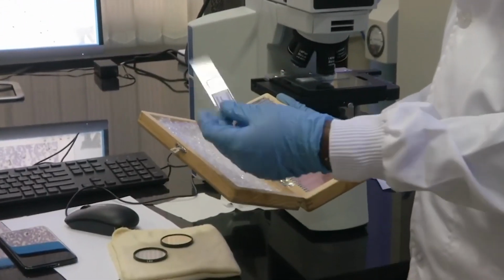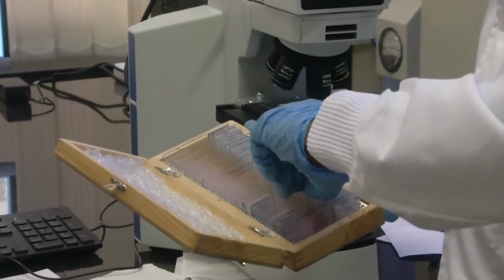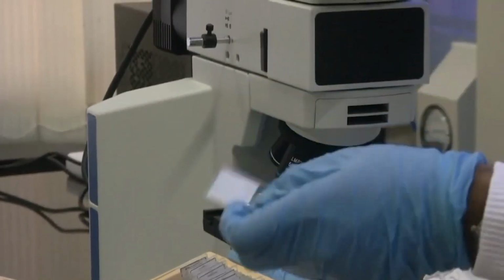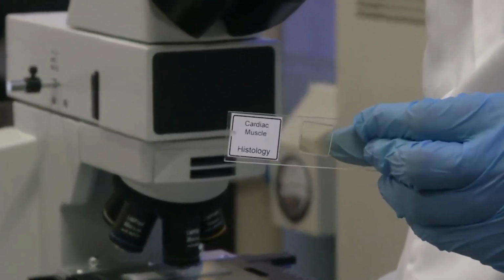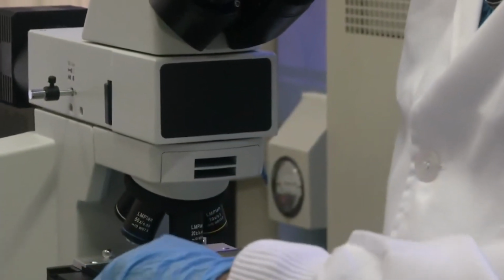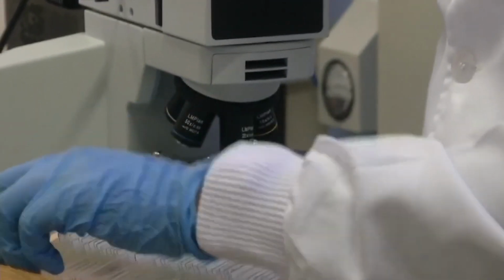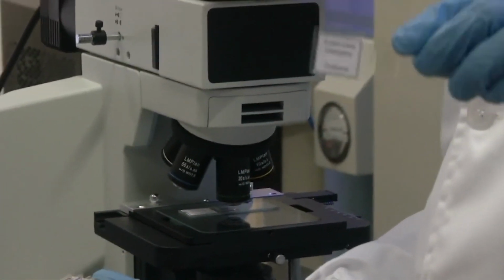So, let us say this is histology of mammalian cells, and this is cardiac muscle histology. Can you see this? Cardiac muscle histology. Let's see one more. I will randomly select. We have Entamoeba histolytica, which is a protozoa.